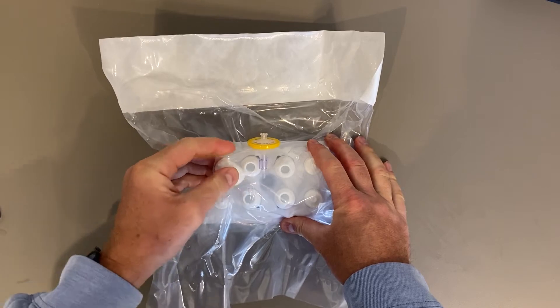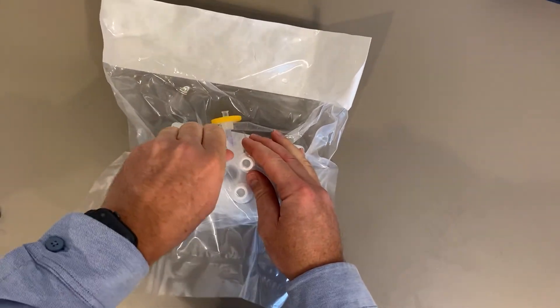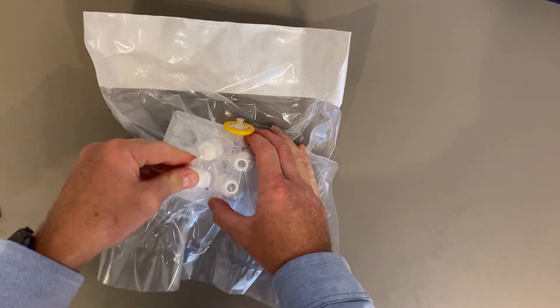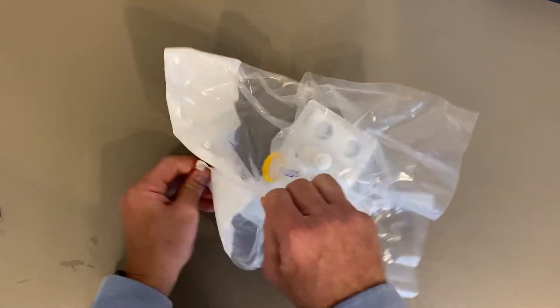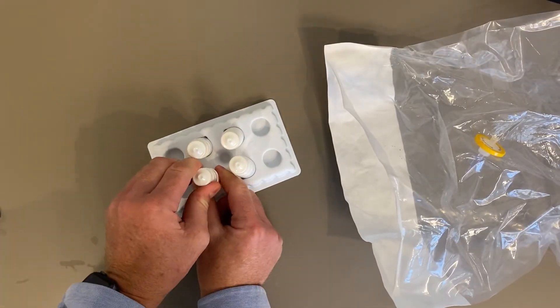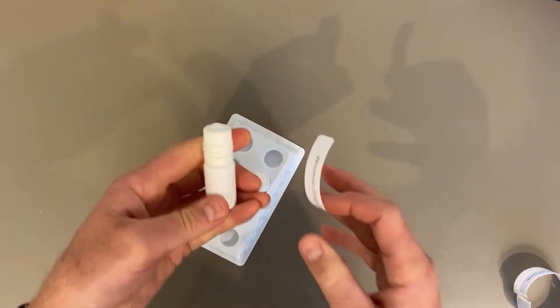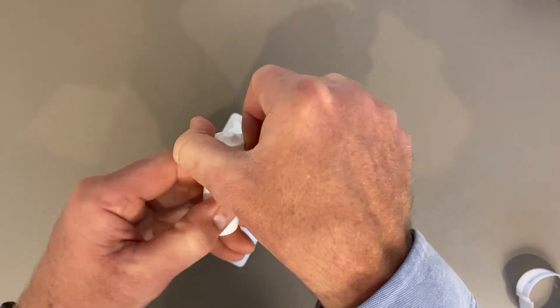I manipulate the caps from the exterior without actually touching or contaminating anything, then twist the caps on. I twist until I feel a couple of clicks, which tells me I'm almost completely sealed, and I do that for each cap. I've got four bottles of 25 milligram per milliliter vancomycin. When all the caps are on, I open the bag and take them out, tightening an additional two or three clicks to get it nice and snug. Nothing within those bottles has been exposed to any non-sterile environment. I label each one with the solution and the date it was made.